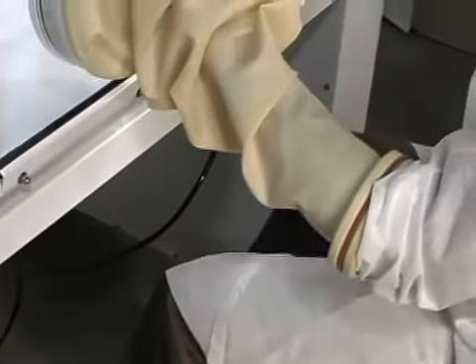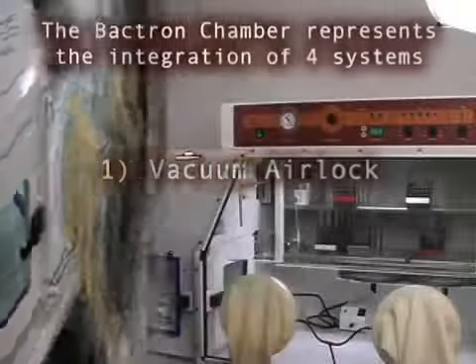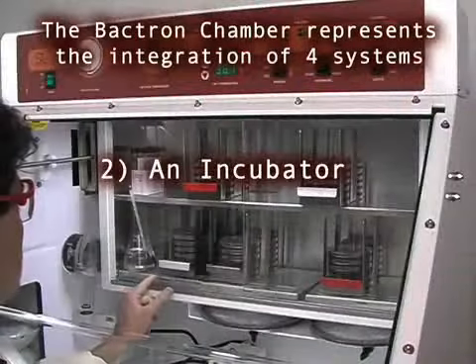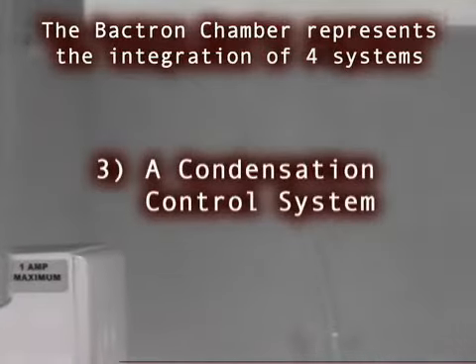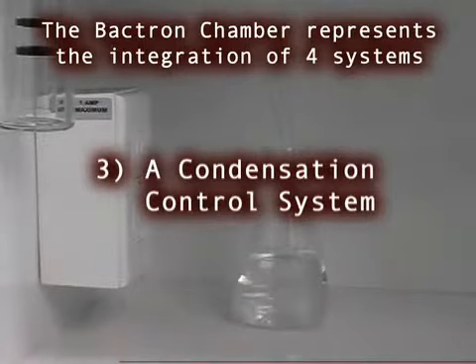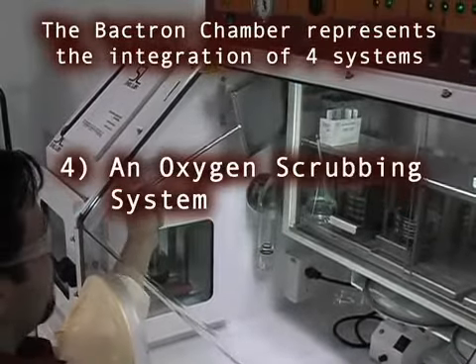The Bactron anaerobic chamber is often referred to as a workstation because of the seamless integration of what was in the past four individual systems: a vacuum-equipped airlock system; an incubator for storage of plates while the work area remains comfortable at room temperature; a condensate control system to collect excess humidity for superior visibility without drying plates; and a scrubbing system integrated to deal with trace amounts of oxygen.